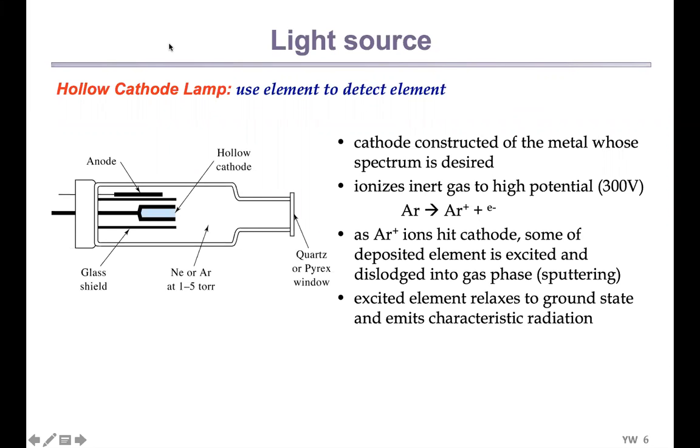It's not covered in this class, but I'd like to mention that you can use mass spec to do a high throughput elemental analysis. We call it ICP-MS. Compared to this one, you can actually detect different elements simultaneously.